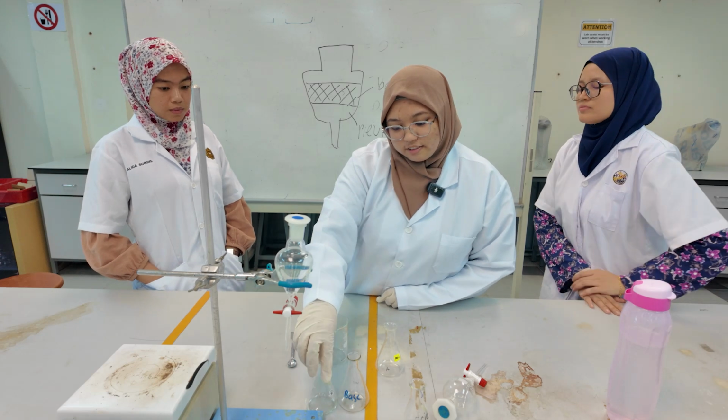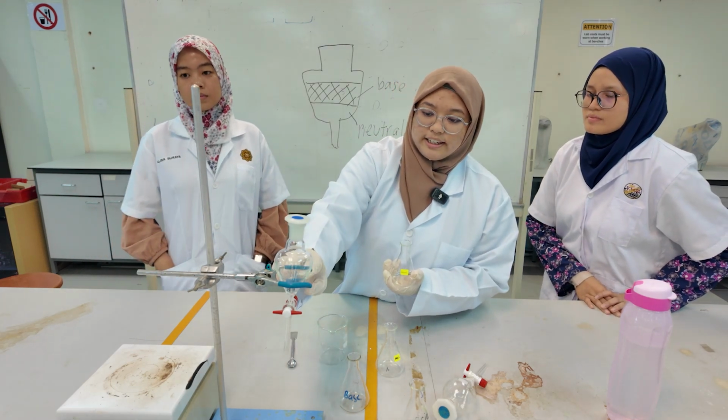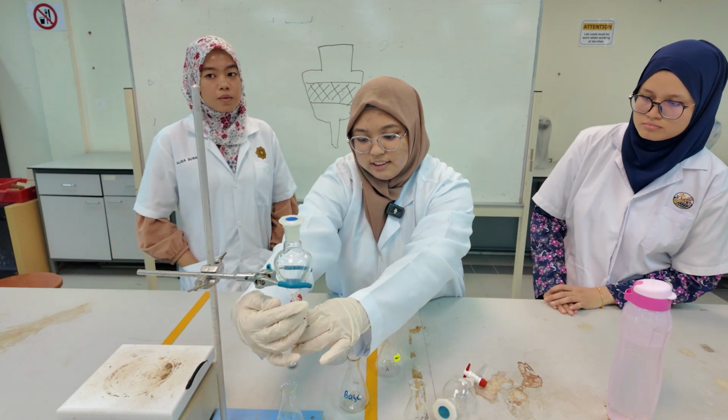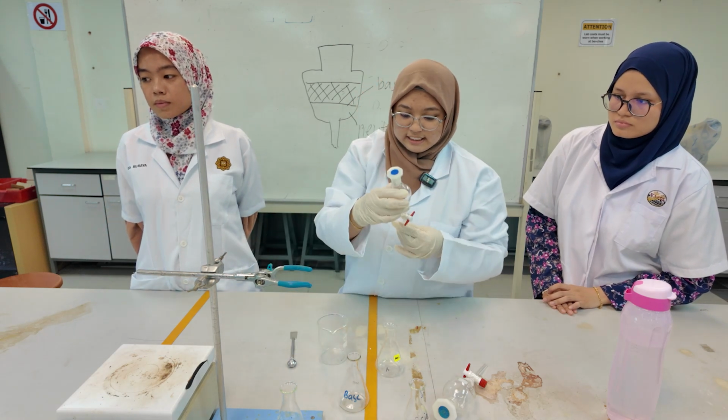So grab the neutral flask, because the neutral layer is at the bottom, so this will be removed first, until only the base layer is left.